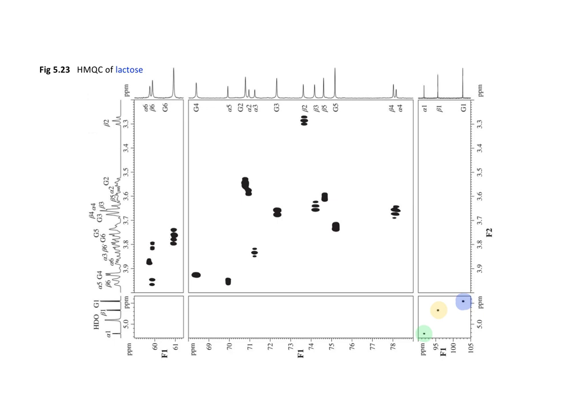Ultimately, all of the assignments given in the spectrum in Figure 5.23 came from applying multiple two-dimensional techniques. However, the key to this is to be able to assign specific proton resonances to specific carbons.